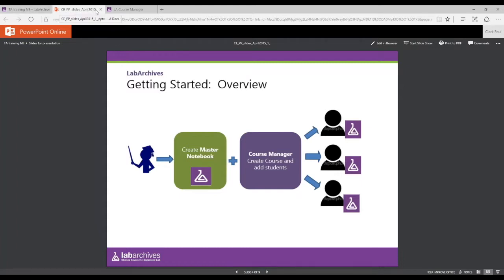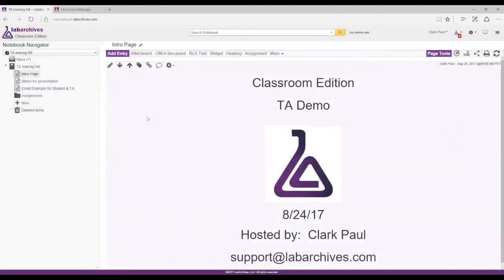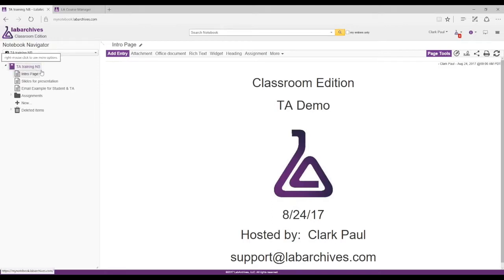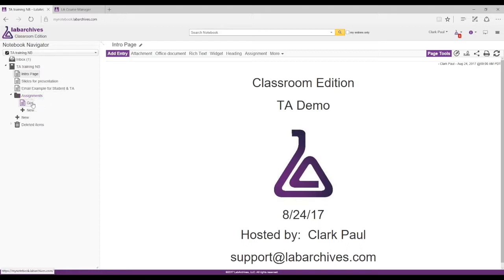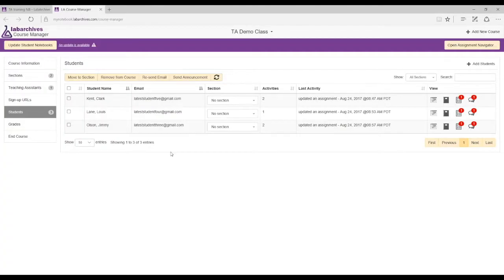Now let's take a closer look at what the TA does. I'm acting as the instructor here, and you're going to be my TA. I created a TA training notebook with an assignment about a gel, and I sent that out to my students. The course manager — which you can see but can't modify — gives you access to the student notebooks through it.